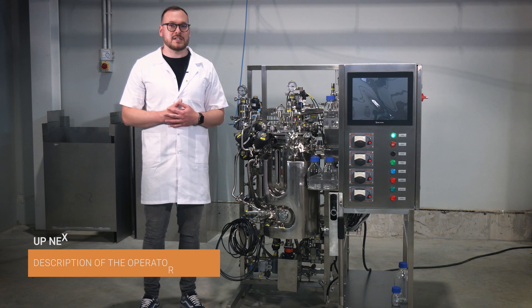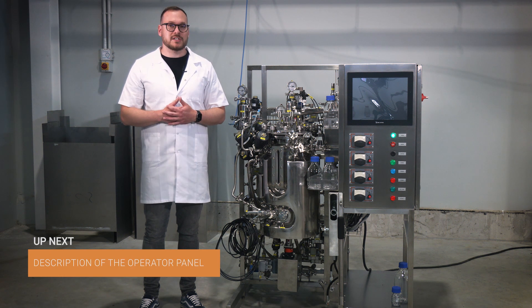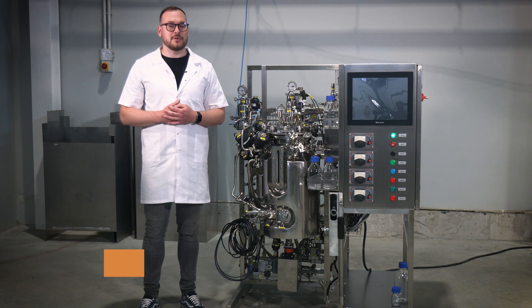Congratulations! You have successfully completed the service connections and power setup for the stainless steel bioreactor. Please refer to the company user manual for further instructions on operating and controlling the bioreactor.